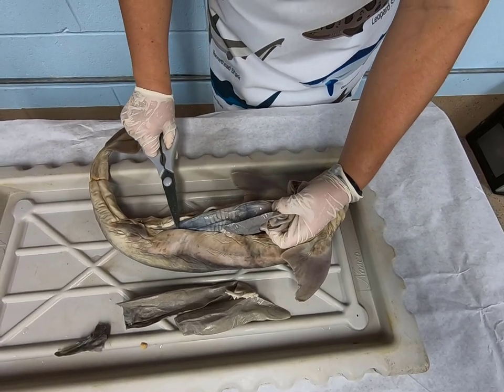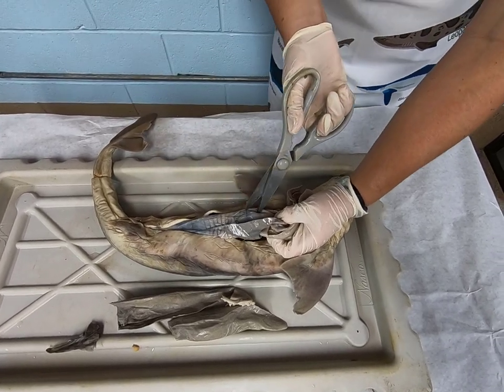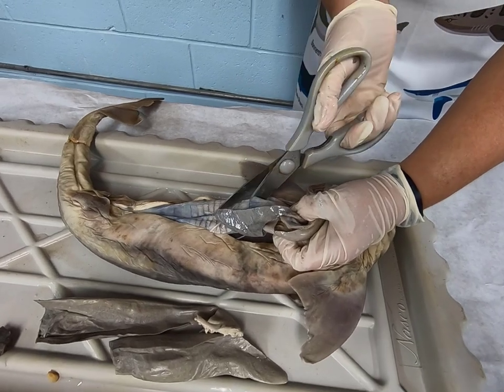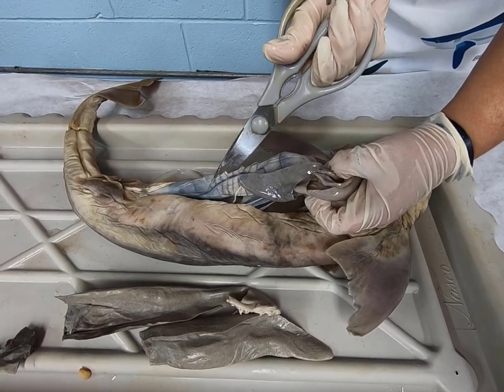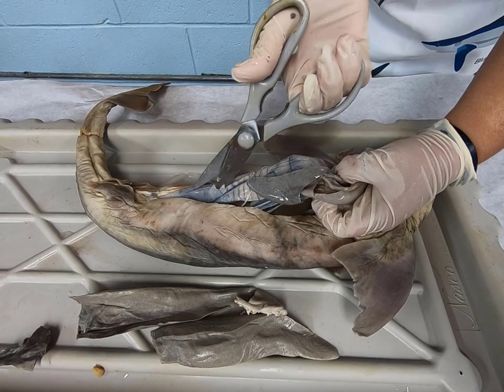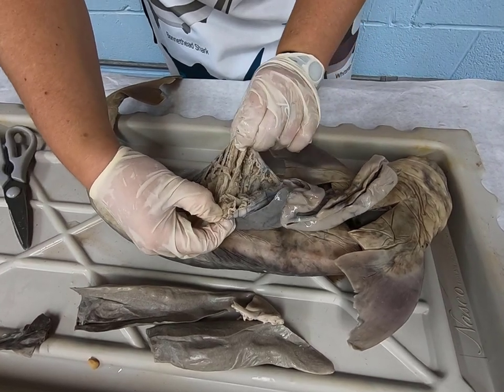But since these guys are so fusiform, so tightly compact so they can easily swim through the water, they actually have what's called a spiral valve. And a spiral valve is basically, I like to think of it as like a slip and slide. So if you've ever gone on a slip and slide that curves round and round and round, it gets you from point A to point B a little bit slower. And that's the whole point of intestines. This right here is a spiral valve.